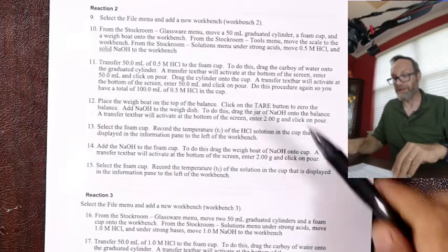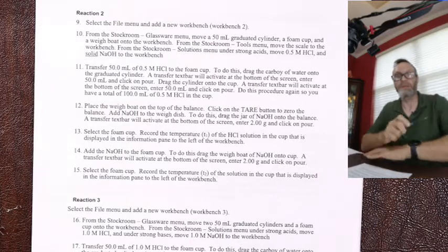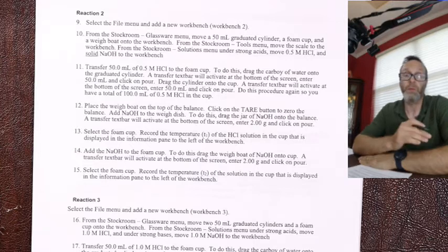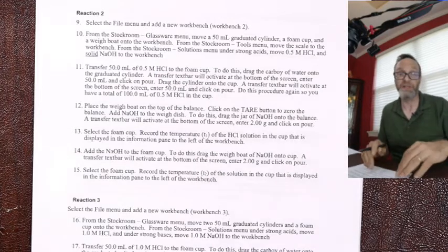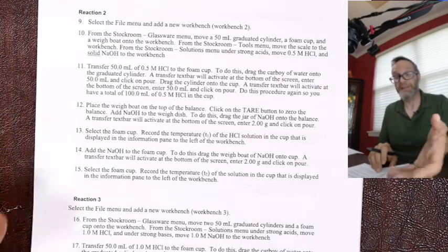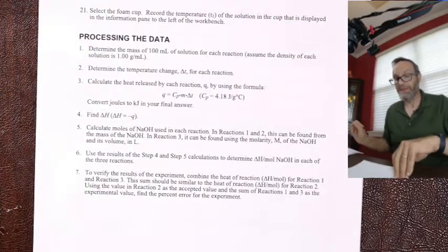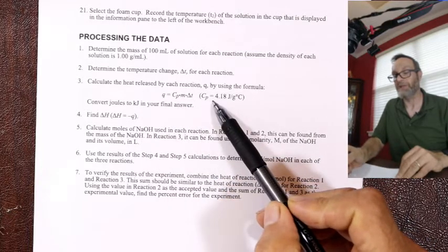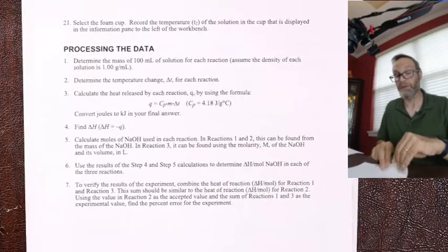So you do a couple of reactions, and as a heads up on that, if you remember in the Thermo Chemistry packet, I talk about the coffee cup calorimeter, and we actually do a worked example of acid plus base on that one. So you'll see how, when we worked out kilojoules per mole, that's essentially what you're doing here. So there's a very good practice example in the notes. You do that variation on a theme, that practice example, 3 times, 3 different reactions. We talked about this. This is the first law of thermodynamics, and the Q in the first law of thermodynamics comes from calorimetry. Follow that through, and you'll be able to work out kilojoules per mole for those 3 reactions.